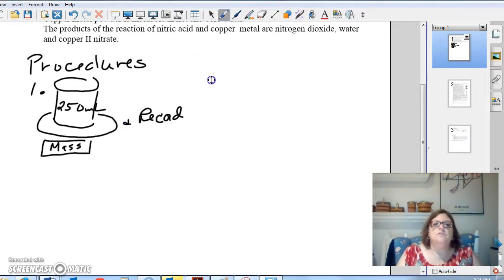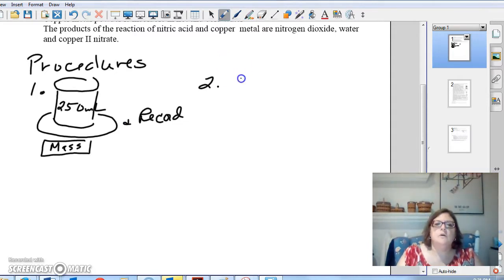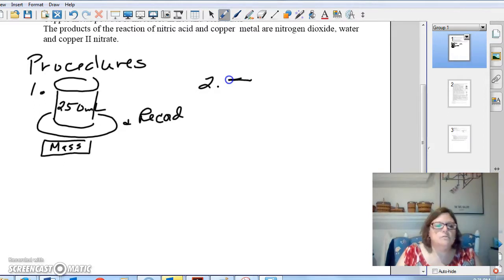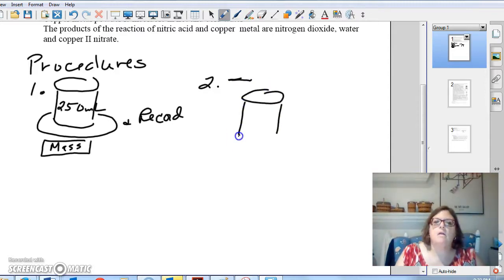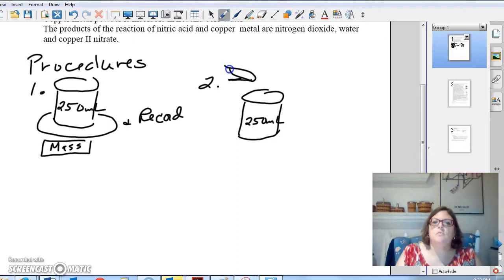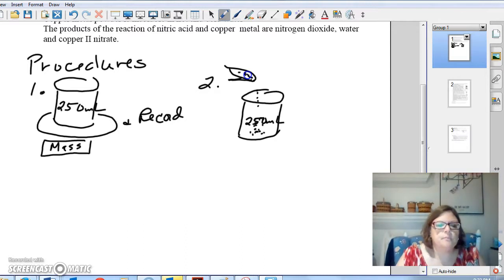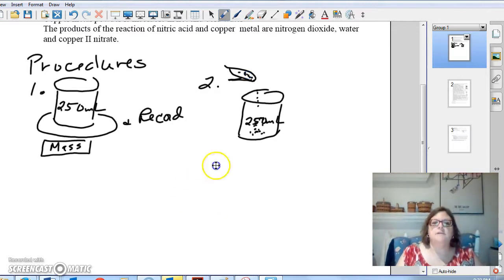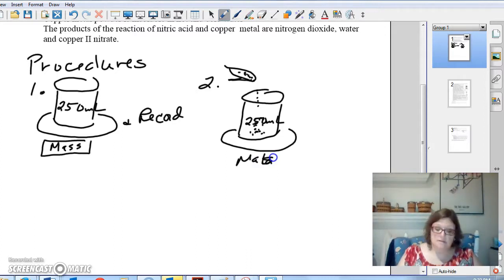Now, you're going to step two. You're going to get the mixture from the front lab station, and you're going to pour the mixture - it's in a little white boat - and you're going to pour it into your beaker. So, here's your little boat with your mixture. So, I told you it doesn't have to be good drawing. And it's going to go in there. Okay. Then, you're going to mass it again. So, here's our balance. It has a round. I started to write mass, and then I said balance, so I started to write malance.